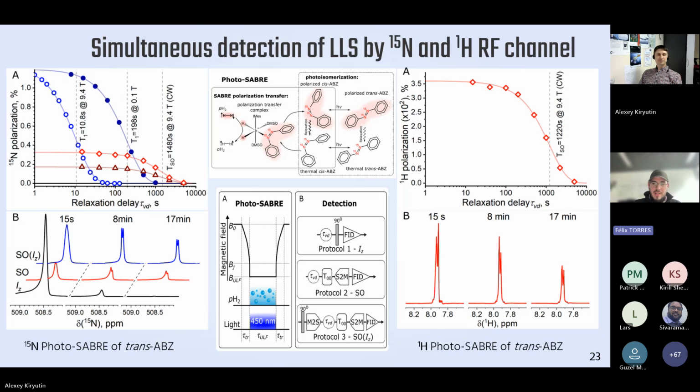We have a question from Sadam Adebayo. Thank you for the good work. My question is, does this signal enhancement help in the acquisition of 2D NMR spectra? Oh, yeah, sure. It's possible. I think I have even done a 2D experiment with the hyperpolarized azobenzene. I think it was kind of noisy. Within a single scan you can acquire one transient, and the important thing is that it should be reproducible, but our setup is actually quite reproducible, and every transient could be started with almost the same amount of polarization. Yeah, it's possible.